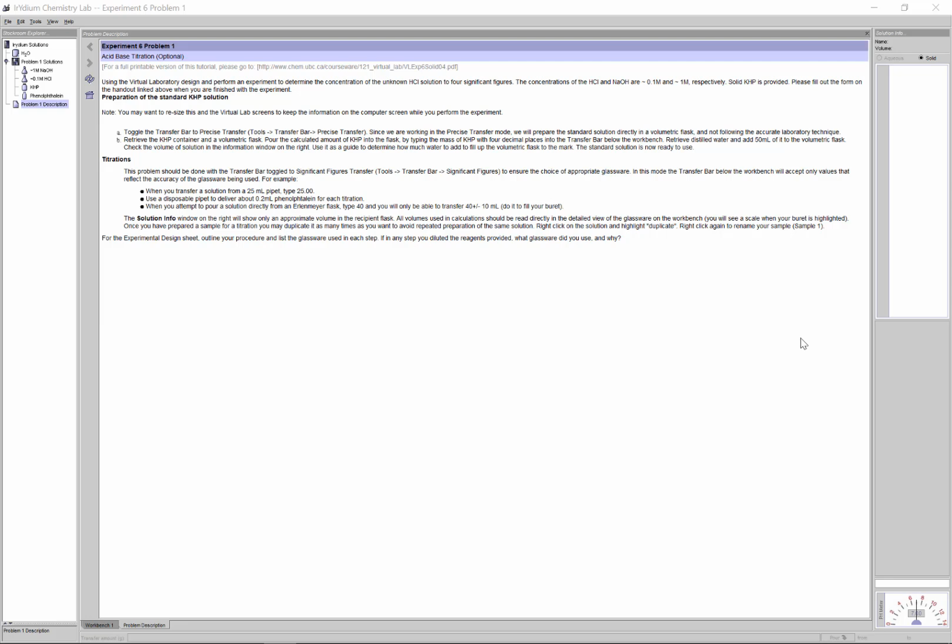Morning everyone. So yesterday we introduced a chemical technique called the titration. The goal of a titration is to determine some unknown concentration to a really high precision. What I was hoping to do with you here is, using this virtual lab environment, actually simulate for you a titration. That way hopefully it'll help you visualize some of the glassware involved.